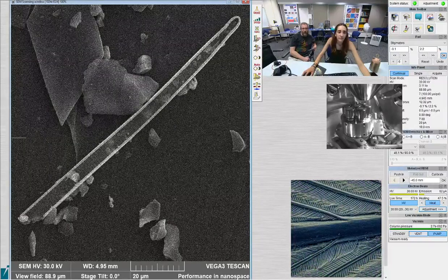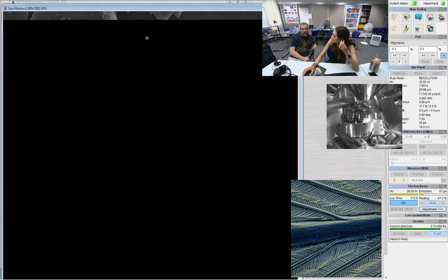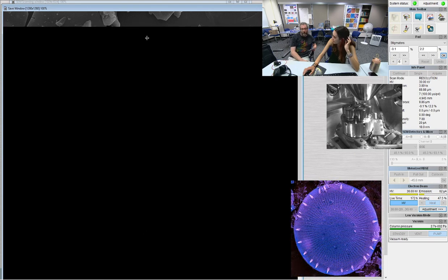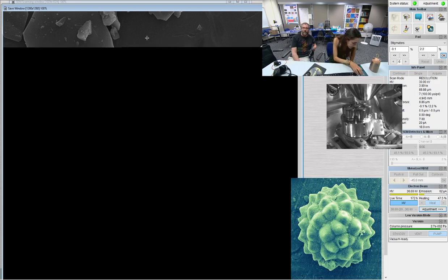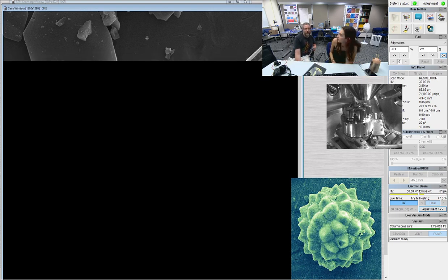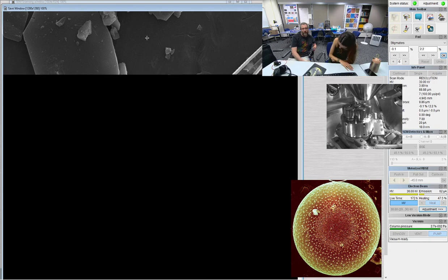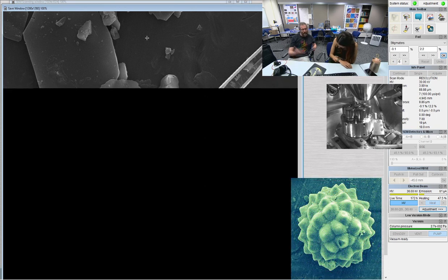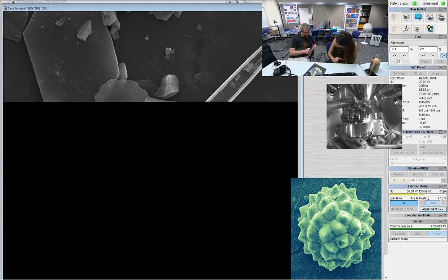We have had people here looking at solar cells, microchips, and I think somebody was looking at some sort of microfiber stuff. Usually I just sit here and try to get what they tell me to get into focus. The primary reason that we charge them is because we need to maintain the instrument, but also they don't know how to use my SEM, so I have to sit here with them, and it takes up my time. I don't actually pay myself any of that money. It just goes into the account, but we use it to help resupply.